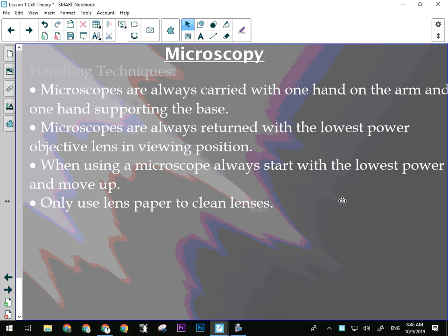So tomorrow, when we go into the lab, we will be looking at an amoeba, a paramecium, and the euglena. Those will be the three things for sure, as well as, and this is the most exciting one, the letter E. The reason that we have to look at the letter E is it's something that we know the proper orientation of. And that'll help us to see what a microscope does to the objects that we look at through it. I showed you that yesterday when I showed you how the light path goes through the lens, and what happens to it. That's going to be important, by the way, for your hypothesis in the microscopy lab.